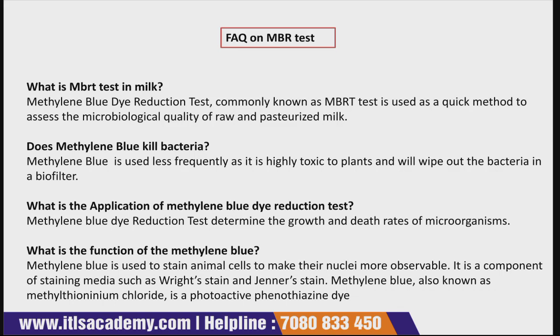So what are the frequently asked questions? The first question is, what is the MBRT test in milk? In exams and interviews, this question is always there. MBRT is the methylene blue dye reduction test. It is commonly known as the MBRT test, and it is used as a quick method to assess the microbiological quality of raw as well as pasteurized milk. So this is the answer to the question.